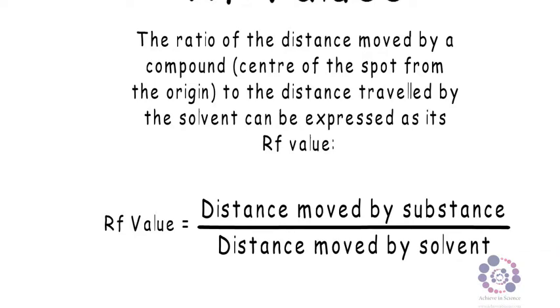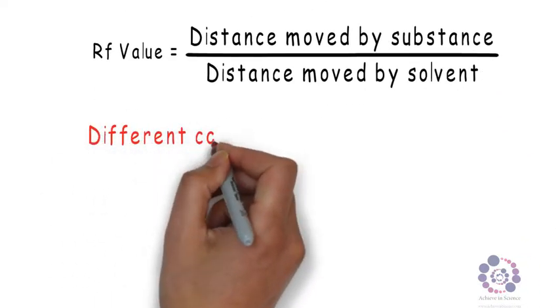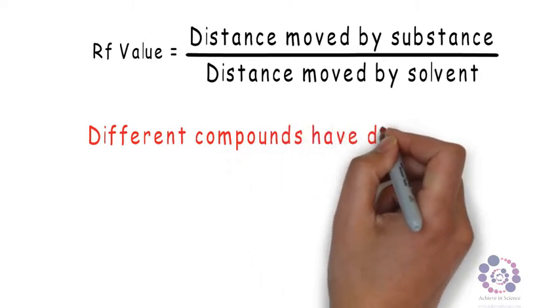Now this RF value is unique because different compounds have different RF values in different solvents.